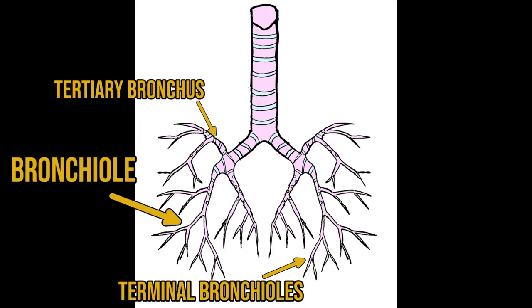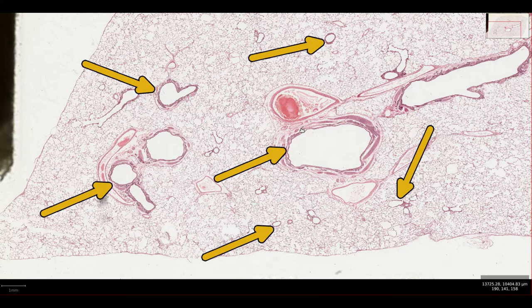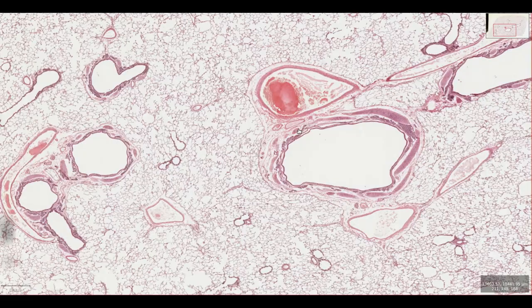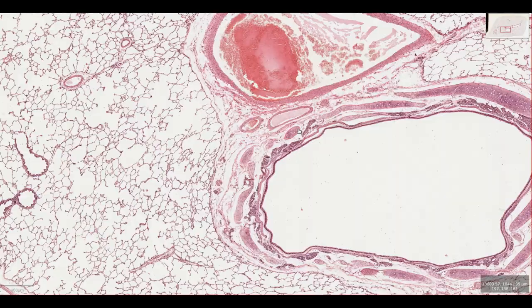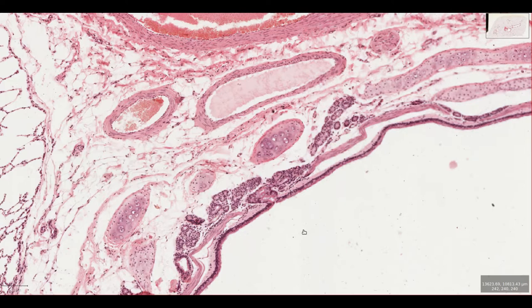This is a slide of inflated cat lung. At low power we can see plenty of round tubular structures, so let's zoom in on the biggest one. This is a bronchus. It's accompanied by blood vessels and nerves. The bronchus has a layered structure, so let's start with the epithelium, the layer forming the boundary between the lumen and underlying tissue.